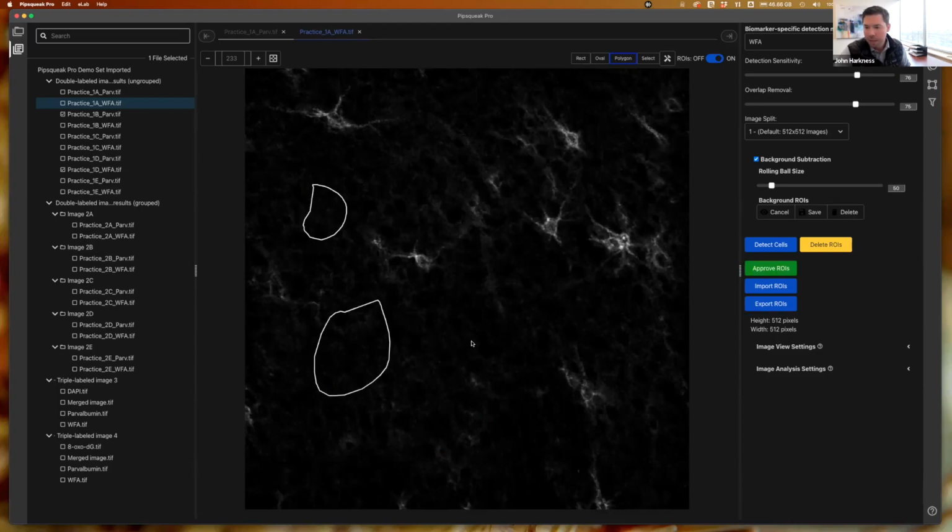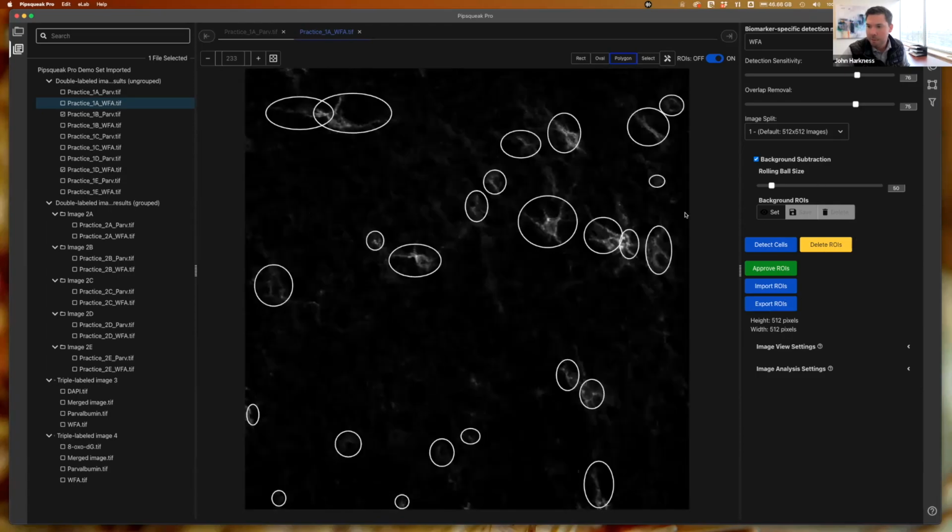I think typically drawing 3 ROIs from around your image is pretty standard. So you can do whatever fits your needs best. But there are a couple of different things you can do. To save this, I'm just going to press save. That goes back to my analysis window, and I'm set to go.